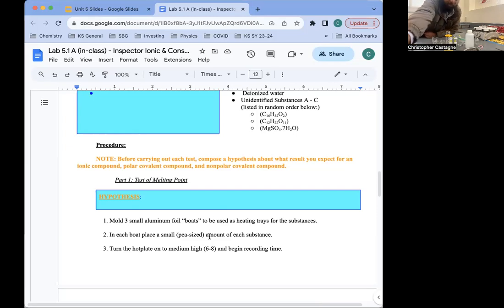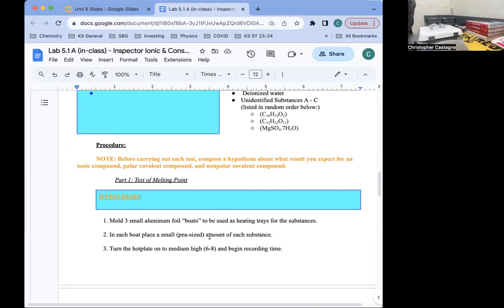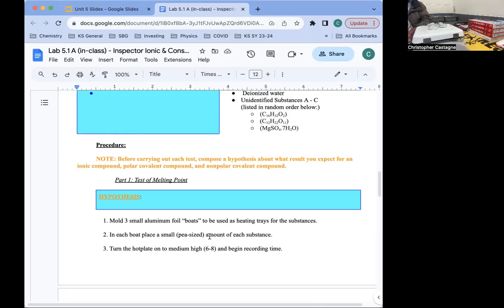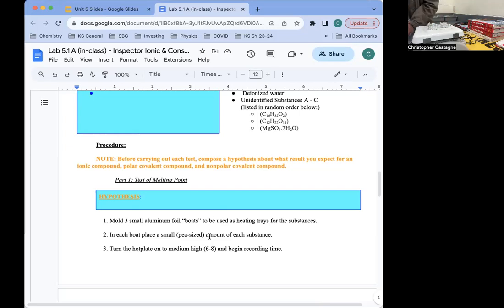I want to put just one small scoop — we don't want to put too much because then it might take too long to melt. I'm going to put about half a scoop and spread it around on the base of the foil. If we put it in a pile, the bottom might start to melt and we might not see it because it could be covered by solid substance. I want to make sure I don't cross-contaminate, so I'll wash my spoon each time in between.